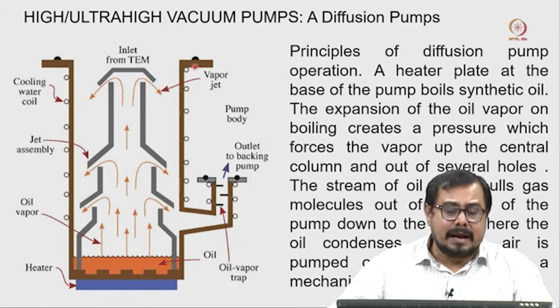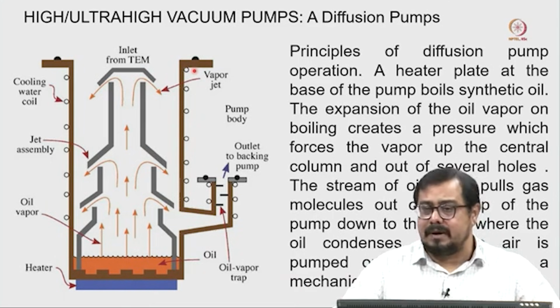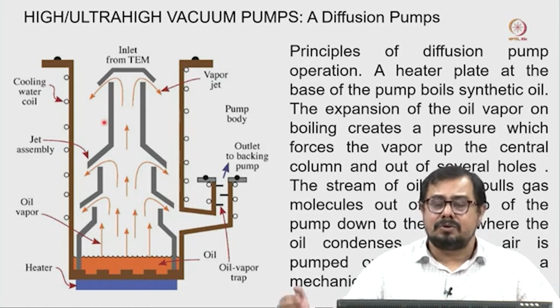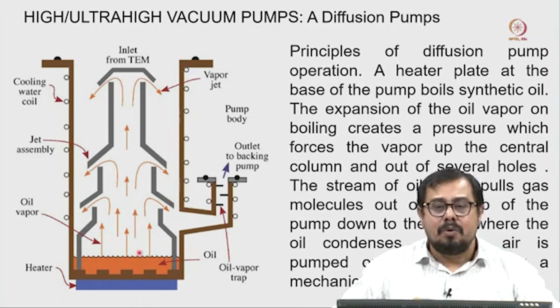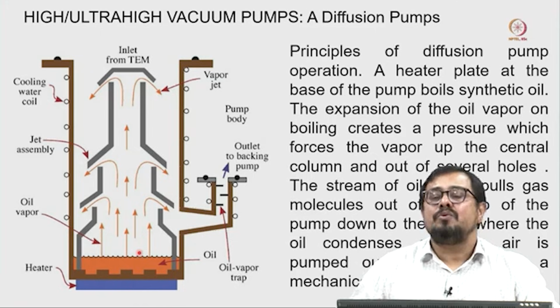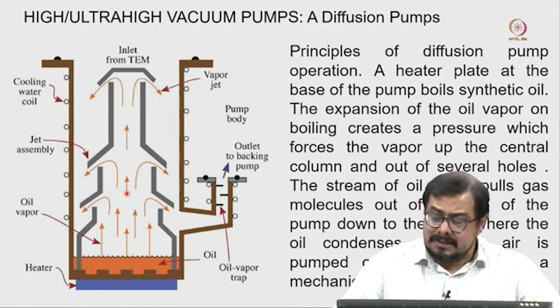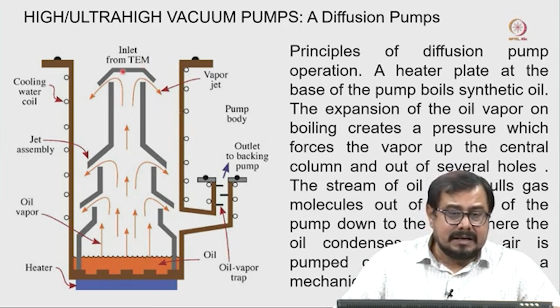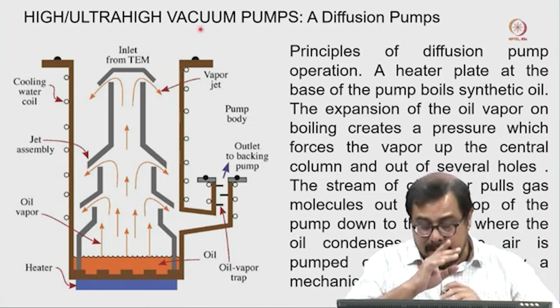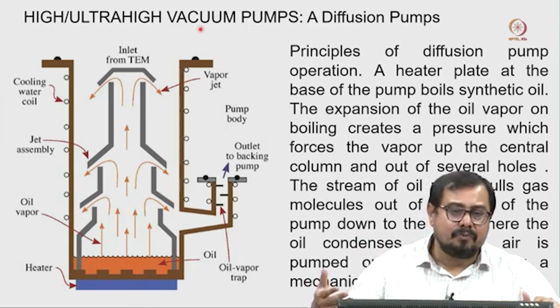That is the reason whenever we are collecting data, we need a noise-free room. Even noise should not come from the AC or any other environment. So, definitely if the pumps attached to the microscope generate lots of noise and vibration, that is going to affect our image quality. That is one of the reasons we prefer pumps which do not generate noise and can give us a very high vacuum. The oil diffusion pump is one of those, not generating too much noise and giving a very high vacuum. But the major problem is that sometimes this oil contaminates the microscope column. That is one of the reasons this is not a very favorable pump nowadays for keeping high vacuum for the microscope.